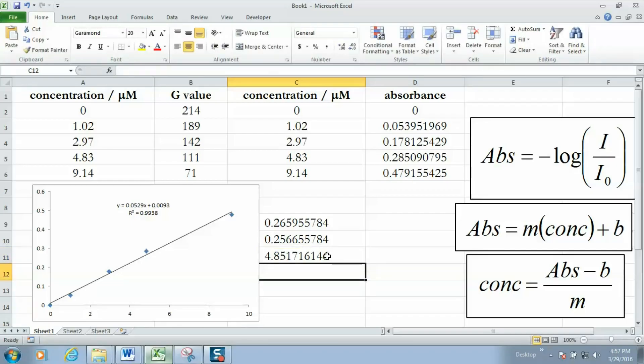And there we have it. The concentration of red dye number 40 that we found in the strawberry Powerade Zero is approximately 4.85 micromolar.